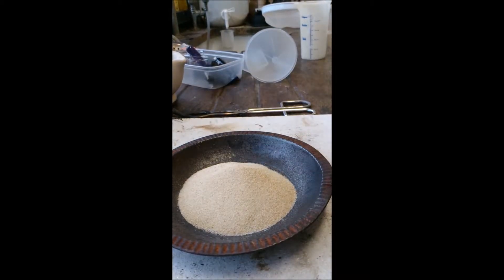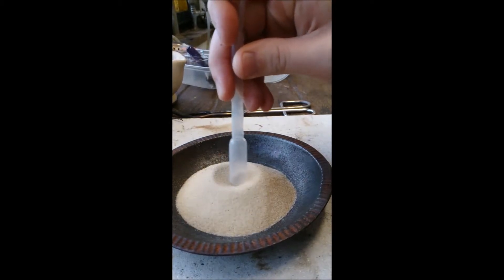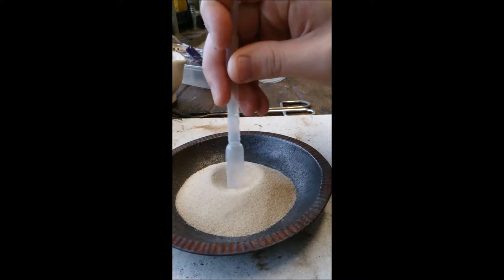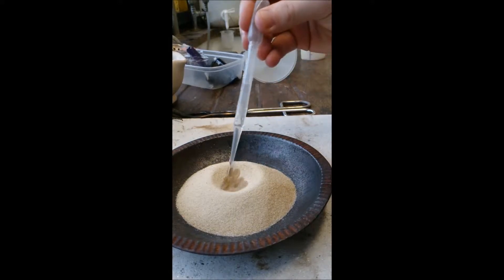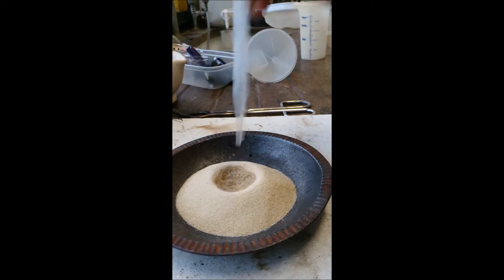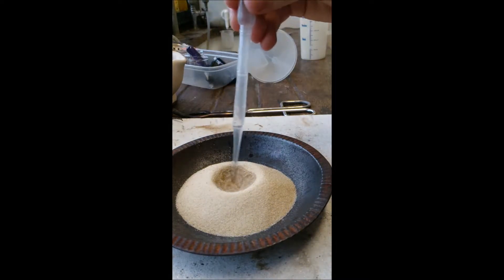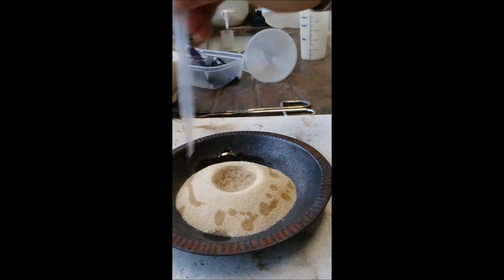Okay, so what I've got there is a metal tin with some sand in. Now I'm going to make a little mound hollow in the middle there. And what I'm going to do is put some — I've got ethanol but you can use lighter fluid, any sort of fluid will do. I'm going to get a nice bit and a bit round the edge as well.